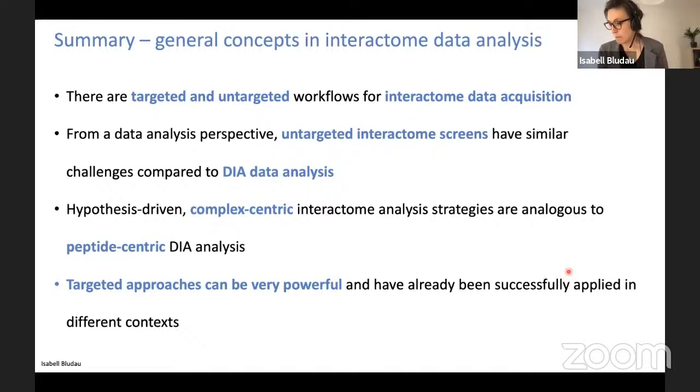So there's a question: how many fractions do you generally use? If we have multiple replicates, can we mix the fractions based on Western blot? I will get to this, but we mostly used a lot of fractions, 60 to 80 fractions by size exclusion chromatography. I would recommend this if you really want to get a good resolution and you want to look also at complex intermediates and not only at general broader scales.